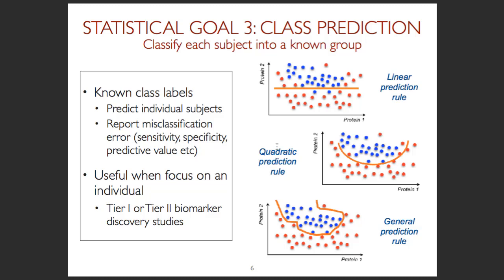But essentially, you would need to have enough data to find the analytes, then to find this type of discriminative rules, and then you would need to have a separate set of biological replicates to apply these rules on new data and show, okay, this is my sensitivity, this is my specificity, and so on. So it is actually a fairly long process, and we will give you some examples of that. Our group has been involved in this type of study, so we will show you a little bit of that. Other questions? Please feel free to interrupt me, even though I speak fast, don't hesitate.